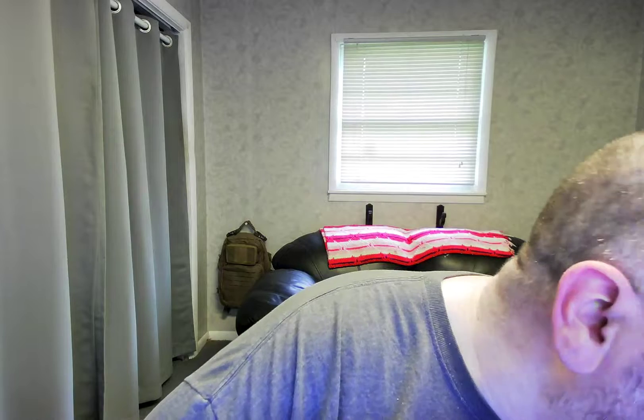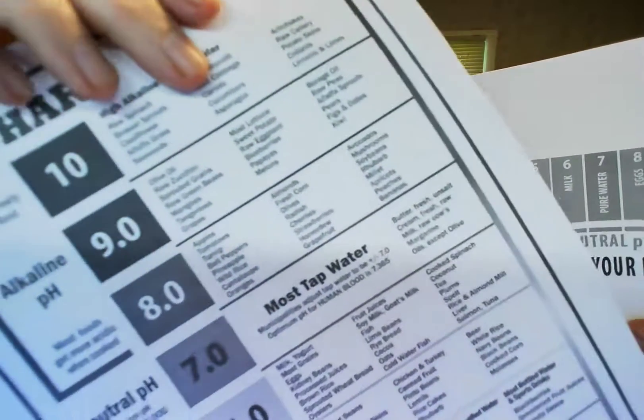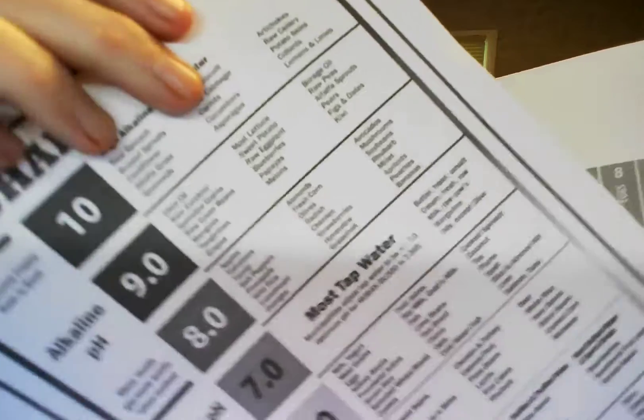I went online and came up with these two charts. There's this one and then there's this one. It tells you, for example, neutral pH, acidic pH, alkaline pH, and where certain things should be. I don't fully understand it, but let's just give it a go.